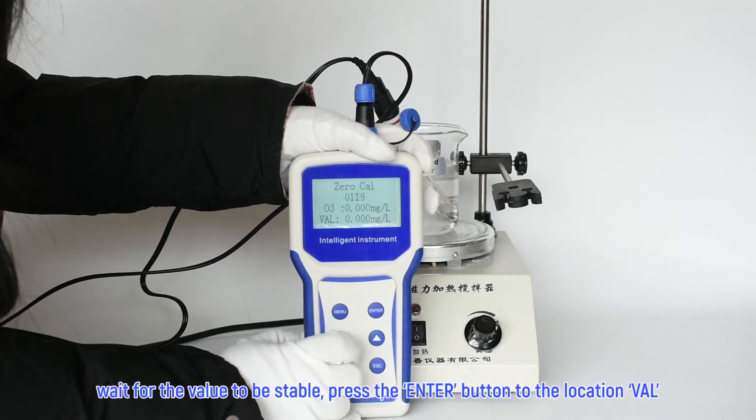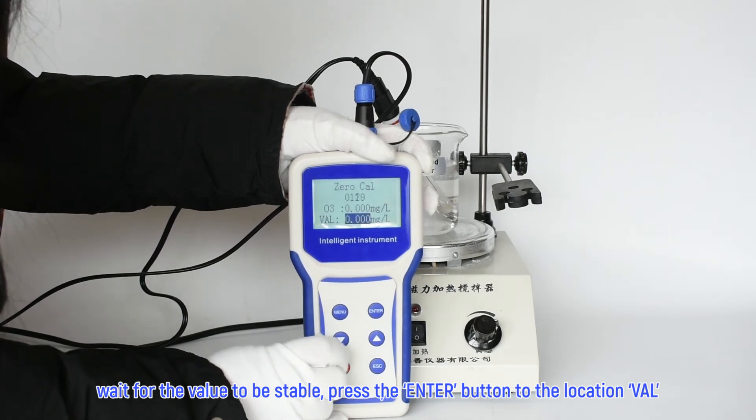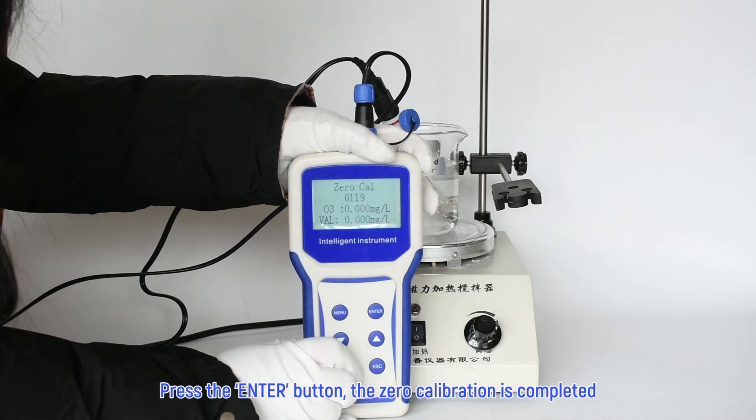Wait for the value to be stable, then press the enter button to navigate to the location VAL. Press the enter button again — the zero calibration is completed.